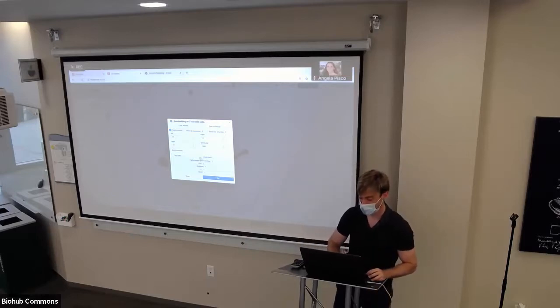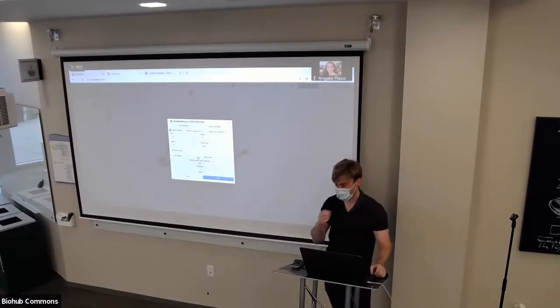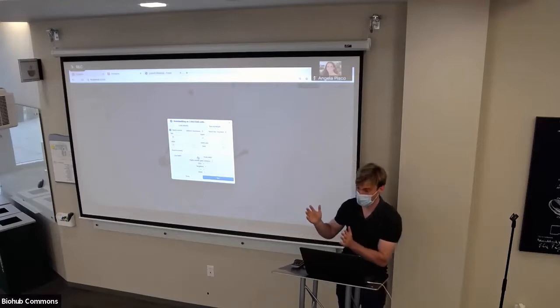But okay, so scale data. What is scale data? Prior to PCA, there's yet another transformation people typically do, which is to standardize your gene expressions to have 0 mean and 1 variance. This basically makes it so that PCA isn't biased towards genes that have a high dynamic range of expression.